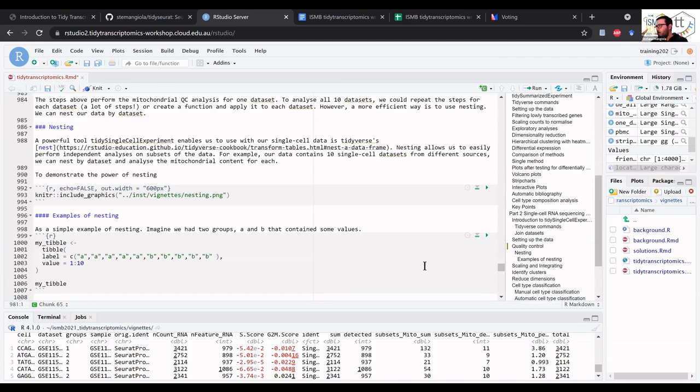Okay, so actually, Stefano, sorry, I have a question. Here we are analyzing the mitochondrial amount. Is it in a data set, or is it usually a sample? Here we've got 10 data sets and 20 samples, so there are 2 samples in each data set. Do you normally analyze them by data set or by sample?